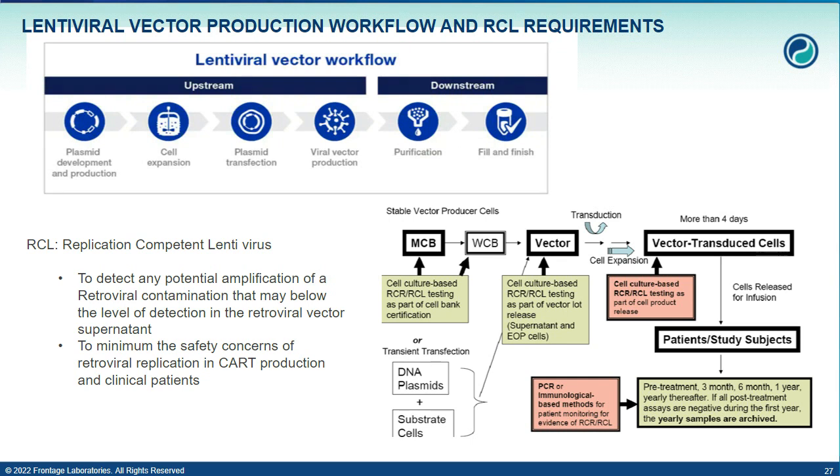So the RCL assay, which represents the replication-competent lentivirus, is to detect any potential amplification of a retroviral contamination that may be below the level of detection in the retroviral vector supernatant. The assay is to minimize the safety concerns of retroviral replication in CAR-T production and clinical patients.